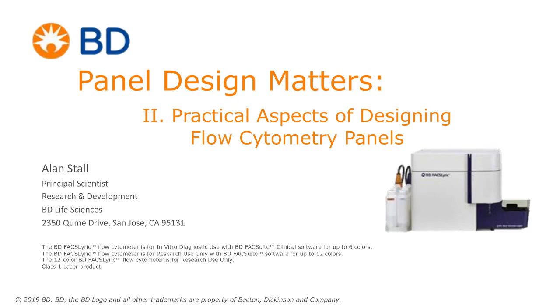Last time we started this webinar series with a talk on compensation basics, where we gained a deeper understanding of what compensation really is and the impact it has on data analysis and quality. So today we'll continue on with that topic by diving deeper into how proper panel design, with consideration of your biology and fluorochrome choices, can really affect the resolution of those populations of interest. If you missed that first webinar, you can find it at bdbiosciences.com under the webinar section.